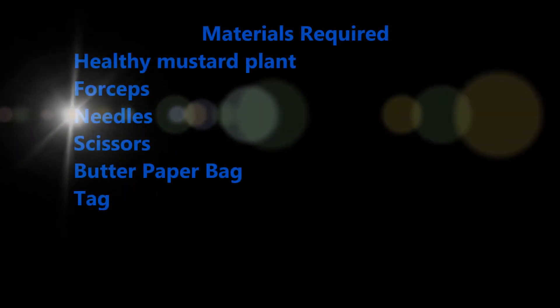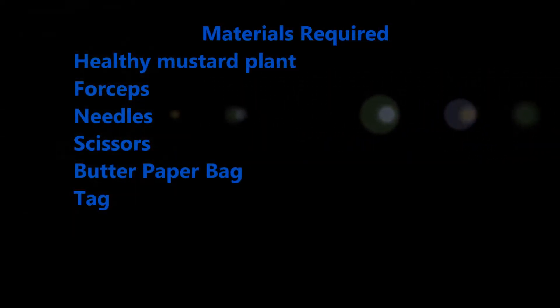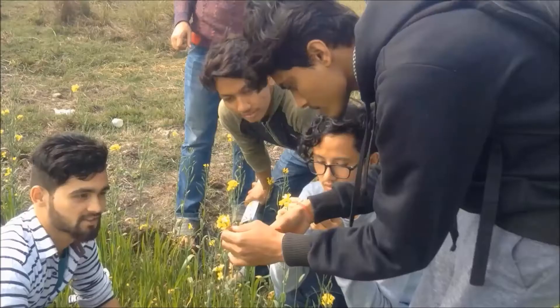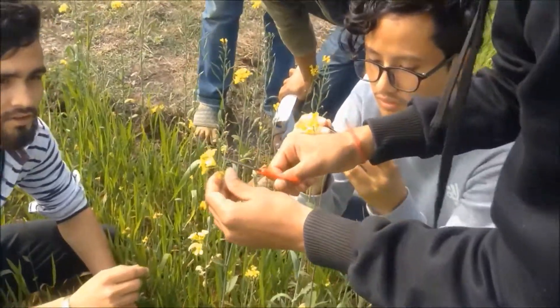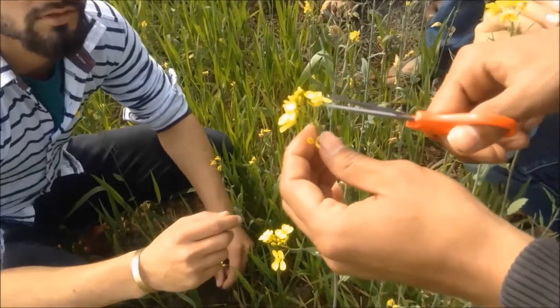Today I am going to demonstrate how emasculation is done in mustard plant. For this we require the materials: healthy mustard plant, forceps, needles, scissors, butter paper bag, and tag. First of all we select a healthy mustard plant.